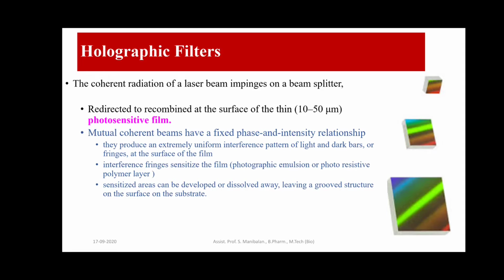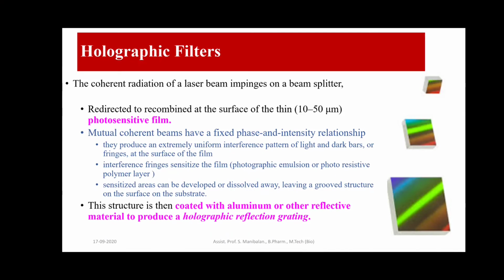Okay, now we are using 3D hologram, virtual 3D hologram. We can set it anywhere, right? And this is the basic mechanism for that. The structure is then coated with aluminum or other reflective material to produce a holographic reflection grating.